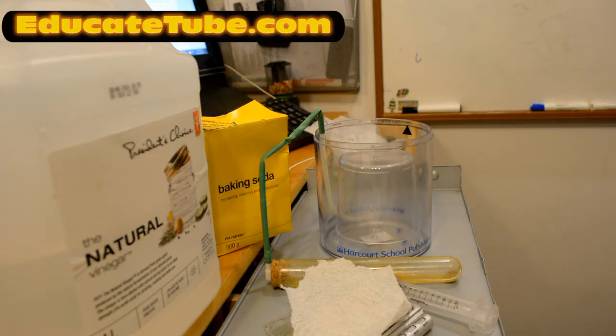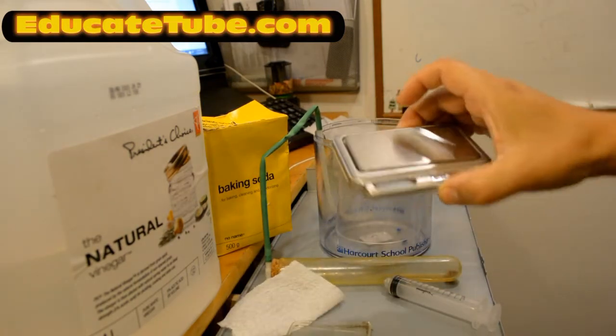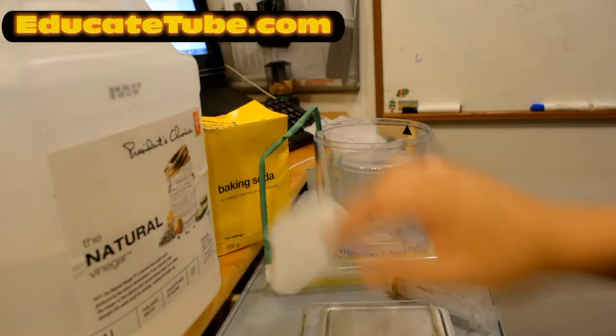Now I don't have that much equipment, but I did salvage a few things together, and I was able to perform this experiment. It's not a standard type of lab equipment, but you can salvage this at home if you know what you're doing. The most important thing is that you need a few measuring instruments. The first thing you need, of course, is a balance. I have this digital balance, which is accurate to 0.1 grams, to measure the mass.